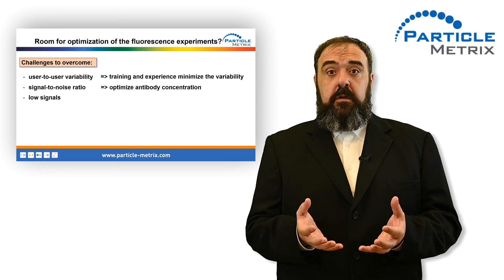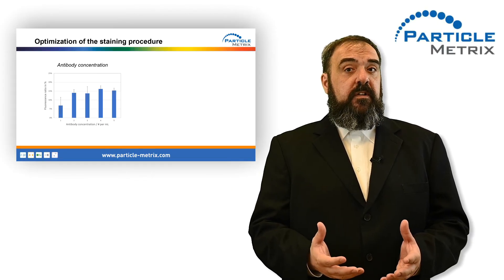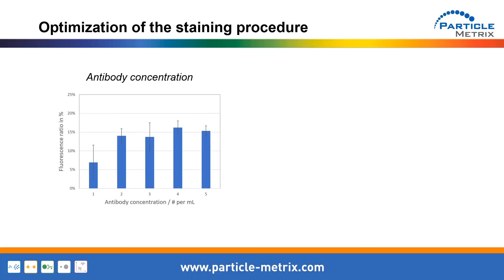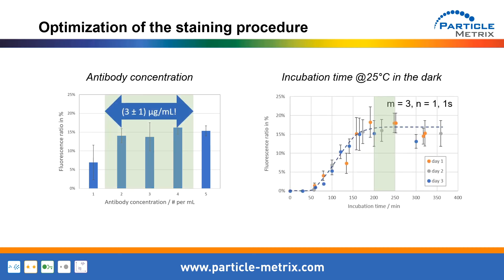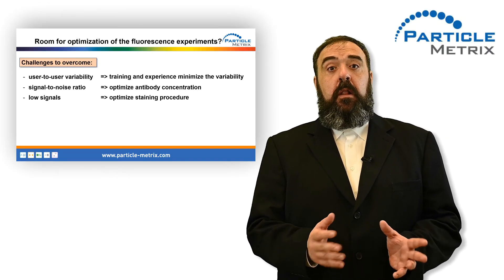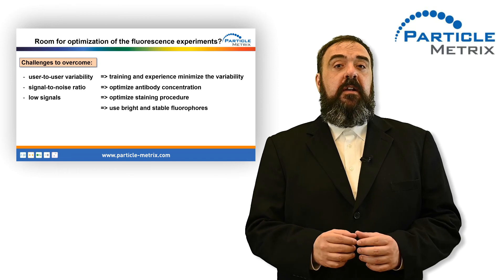Challenge number 3: low signals in general. In contrast to cells, the surface of extracellular vesicles is very small. The number of binding sites is rather limited, meaning that only a small number of fluorophores will be present on a particle. The easiest way to deal with this challenge is optimization of the staining procedure. This does not only refer to the adaptation of the antibody-to-vesicle ratio, but also the general antibody concentration, incubation time, and incubation temperature. Dealing with low signals requires a lot of adaptation. However, the use of bright and stable fluorophores strongly affects the quality of the data.